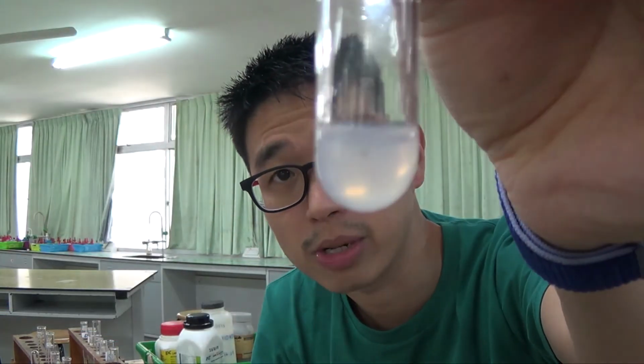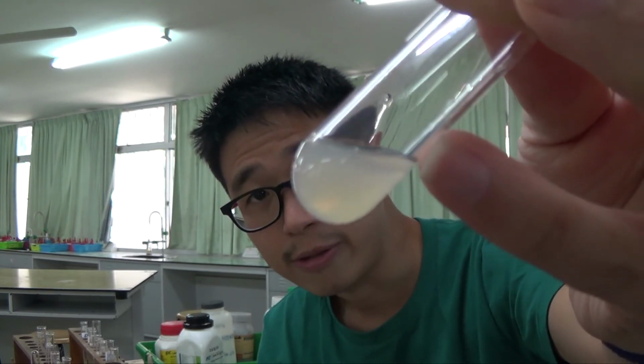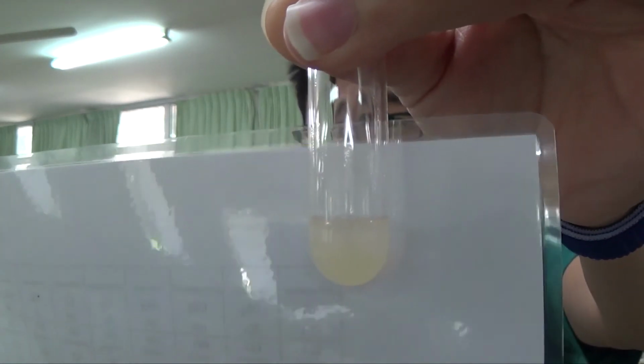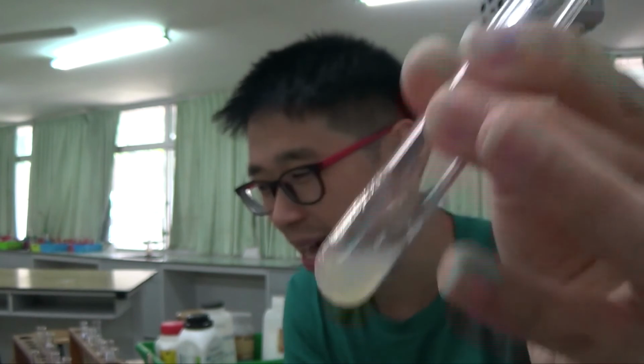Just add a little bit, and you see a white precipitate. Okay, so this is a white precipitate. If I'm not mistaken, in the qualitative analysis notes, they give you Mn2+ as a white precipitate. What do you notice now? The white precipitate has gone off-white. It has gone a bit brownish. It started from the white precipitate. You can rewind the video, and now it's gone a bit browny. This is called off-white. Some people call it coffee. It's gone from a white precipitate to a coffee color there.